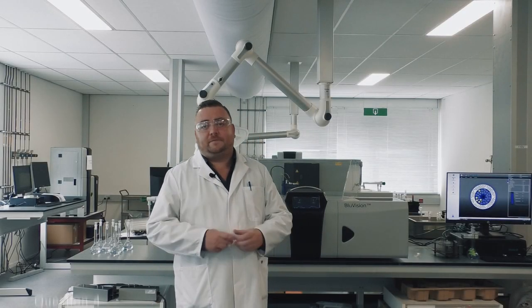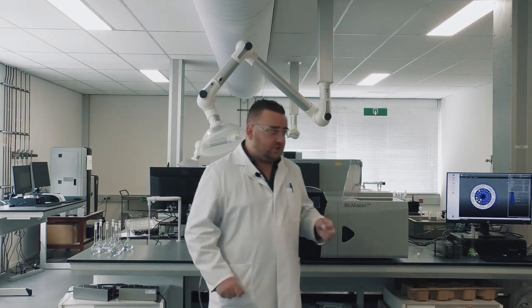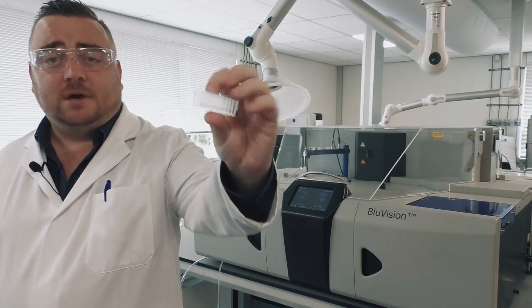So that brings us to question 4. What is the length of the cuvettes we use? So when we say length, we're talking about the optical path length of the cuvettes. And actually, as you can see here, we use a 15 millimeter cuvette. And by going to 15 millimeters, that gives us a lot of additional sensitivity, which means we can offer much lower detection limits. So for example, for things like ammonia and orthophosphate, we actually have sub-ppb detection limits, which gives us very, very low-level ppb quantification limits.